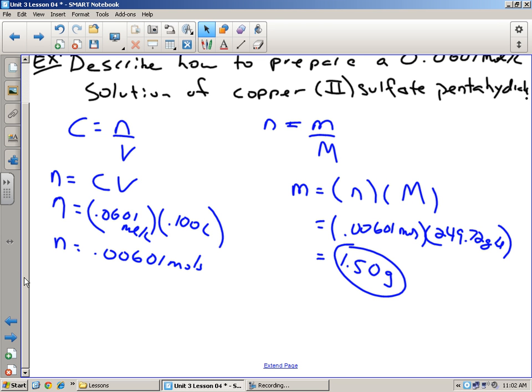If I had to measure out 40 milliliters with this, this is probably not very accurate. In fact, it tells you right on there, plus or minus 5%. Okay, well, 5% of 40 is like 2 milliliters. That's a lot. That's the difference between 38 and 42, basically. So a range of 4. That's lots. Okay. So we're going to use this one here.